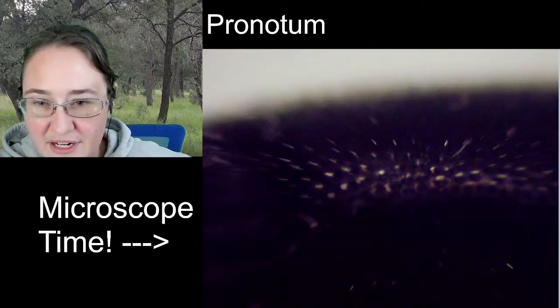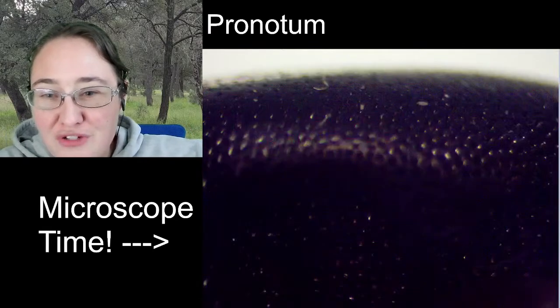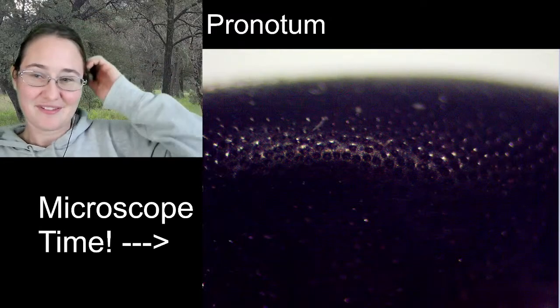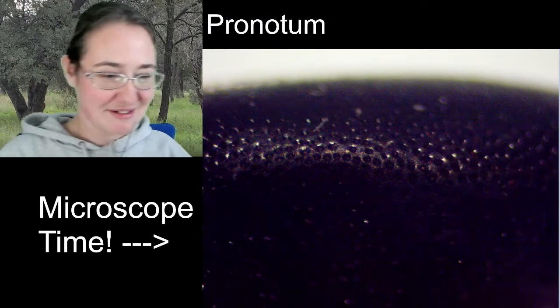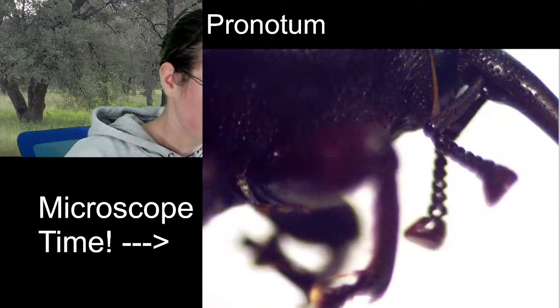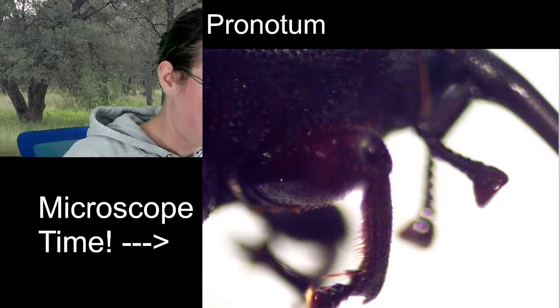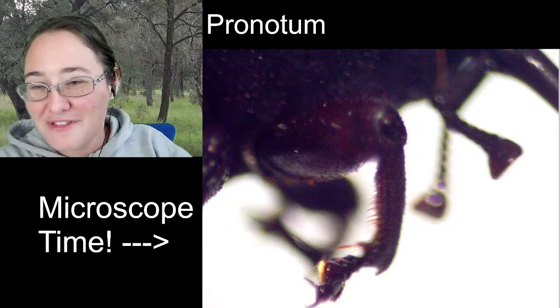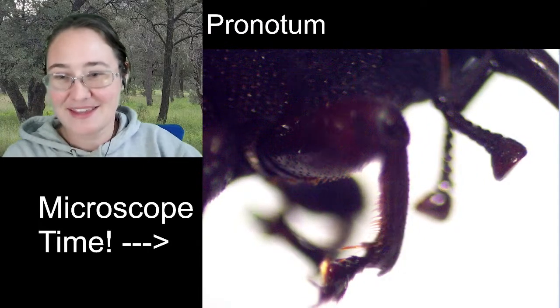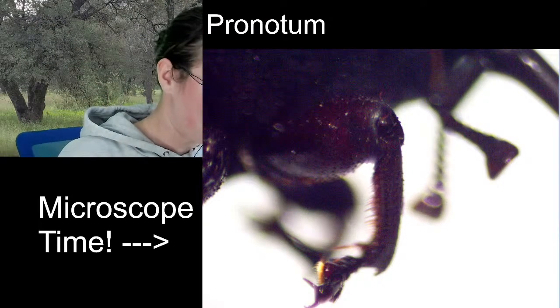Let's see if I can get her. For those of you texture buffs out there, this is the texture of our weevil. Most of the exoskeleton. Look at those tibial claws! And the little tarsal feet! And the little tarsal pads! Okay. I love the little golden hair on the tarsal pads, guys. It's right there at the very tip. We're going to be zooming in there. That's going to be super fun.